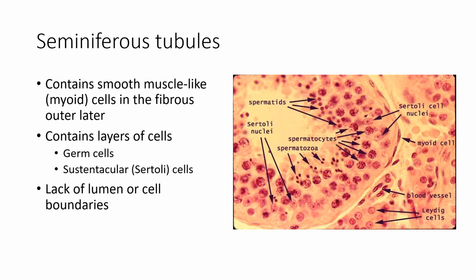Immediately after that, you're going to appreciate other levels of the different germ cells of the sperm at the different growth stages. You can see the spermatocytes, and you can see the full grown spermatozoa. Actually, I think this is not spermatozoa, this is the spermatid, even though the magnification is low, but I can make out that it is a spermatid rather than a spermatozoa. Within the lumen is where you will likely find the full-blown sperm cells.